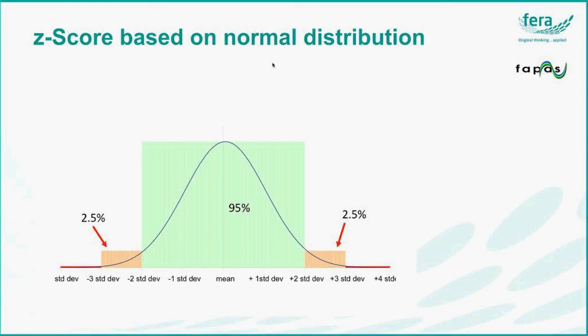The probability of a Z-score being outside 3 standard deviations, however, is a much smaller proportion of that curve. It's about 1 in 300. The probability, therefore, is not very good that you have a genuine result that is okay, but it gives you a Z-score outside of 3. Therefore, that should be an action limit to investigate what has gone wrong.